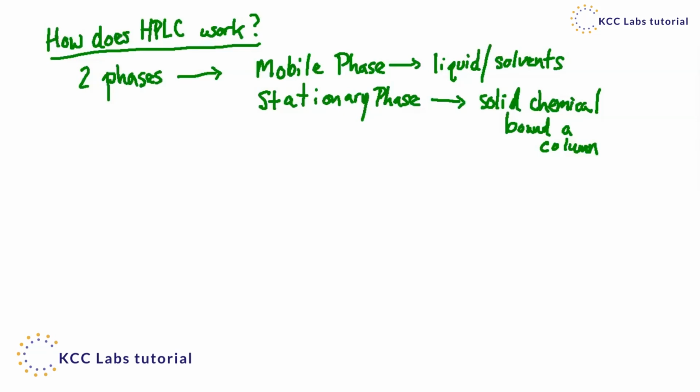And you really have sort of a give and take between the mobile phase and the stationary phase. So when you're doing this, you will take your sample, it will be loaded with the auto-injector into the column along with some mobile phase, and then your sample will adhere to the stationary phase. It's almost like glue or some sort of a sticky pad.